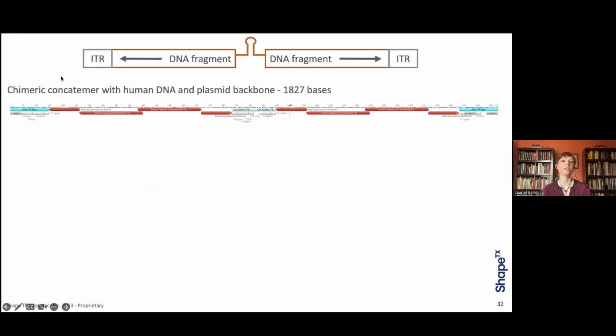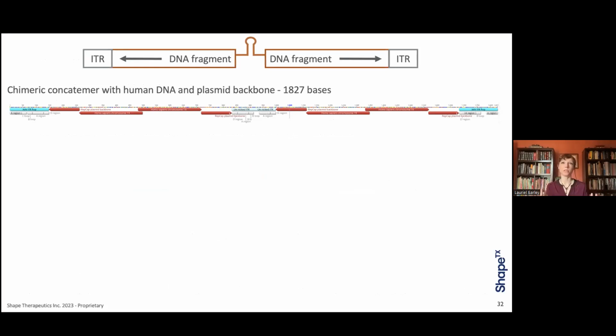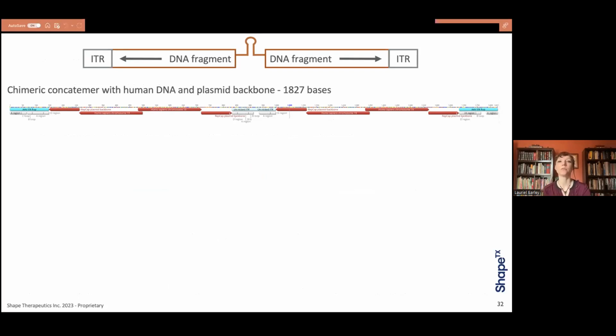And so here we see our chimeric concatemer made from human DNA and plasmid backbone chimerized together with a naturally occurring hairpin. This right here is an unnicked ITR. It's an ITR with 2 D regions. We'll call it the double D ITR. This is evidence of rolling hairpin replication. And we can see that here in the middle.